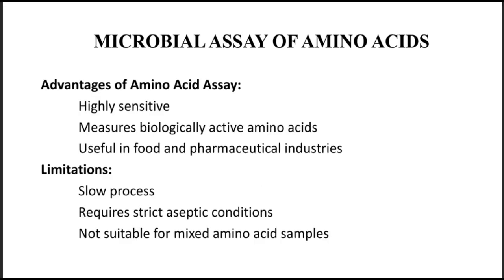Advantage of amino acid assay. Highly sensitive, measure biological active amino acid, useful in food and pharmaceutical industry. Limitation. Slow process, requires strict aseptic condition, not suitable for mixed amino acid sample.